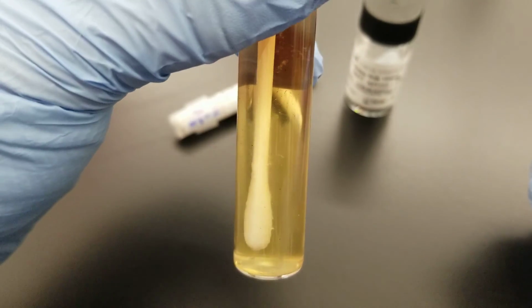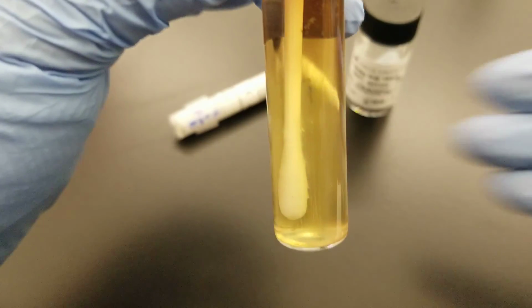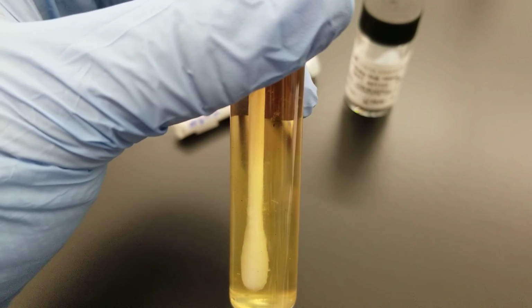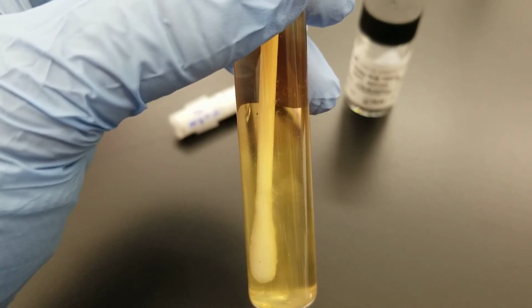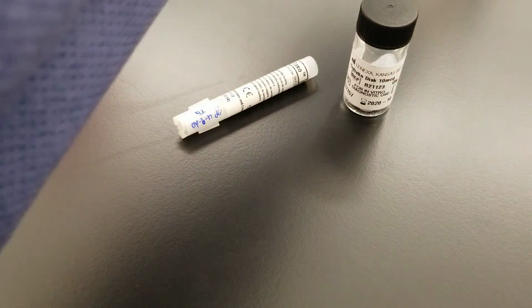You have a nice, well, maybe you can't see it very well. There's a nice cloud at the bottom. So you see that it's growing down there. And this honestly is a culture swab from making the stock culture. So it's not like you're going to put an actual swab in there.